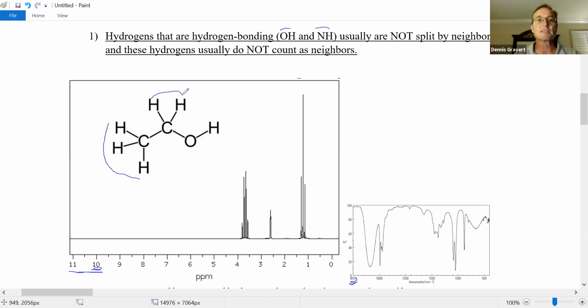These 2 hydrogens are all attached to a carbon. They're equivalent to each other. These 2 H's are going to produce 1 peak. That's not a bond. And then there's a hydrogen on oxygen. This hydrogen still produces a peak. This is hydrogen NMR. All H's must produce peaks. Okay, and I know it's weird, the hydrogen's on an oxygen. It happens whenever you have an alcohol group or a carboxylic acid.